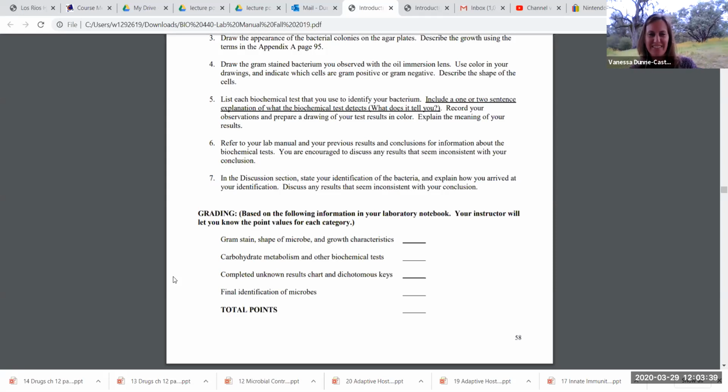I mean, that one's kind of an easy one because fermentation is in and of itself what it is. And then you can say, with these results, I was able to eliminate these organisms and focus on these organisms, and so on. The next test I did was a citrate test. My organism tested positive, which means it can use citrate as a sole carbon source, and it's a heterotroph. This allowed me to eliminate these ones and so on.